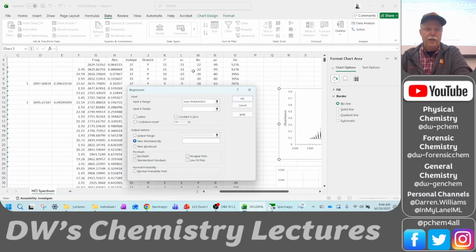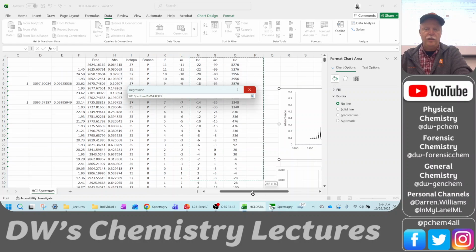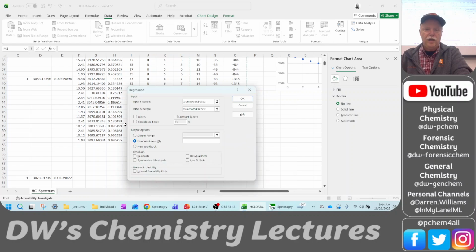And so then we go back up for the X range. And I'm going to get the labels, the BE label, alpha E label, and the DE label. Okay. And I'm going to click this checkbox, labels. That's telling me the first row are the labels. New worksheet ply, that's a good thing to create a new worksheet. I'm going to call it Reg 1, or whatever you want to call it.